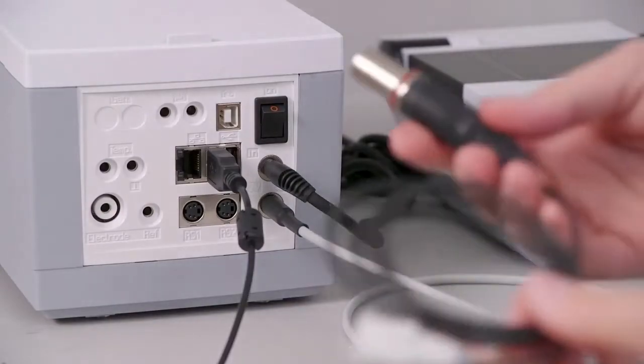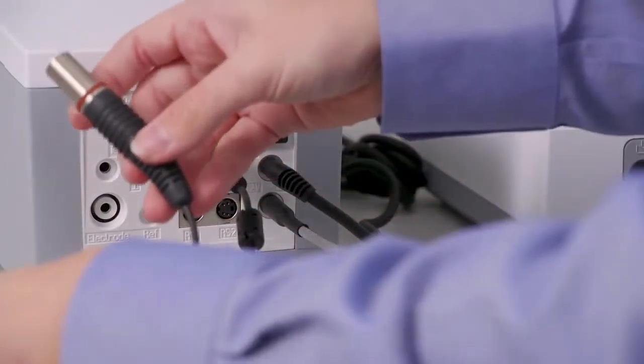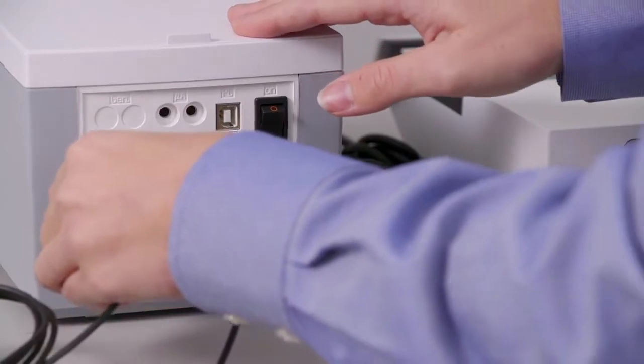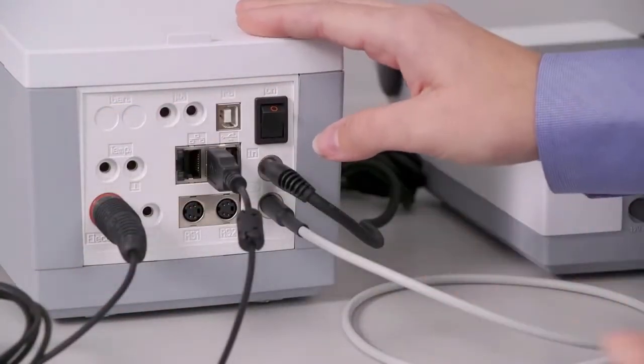The last thing to set up here is the electrode cable. We'll just plug that into the DIN port on the bottom left hand side. Once that's done you're ready to turn it on.